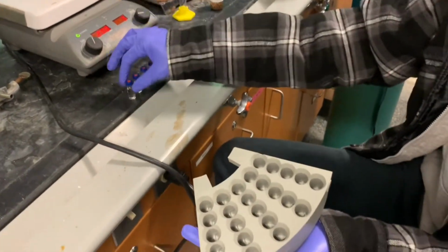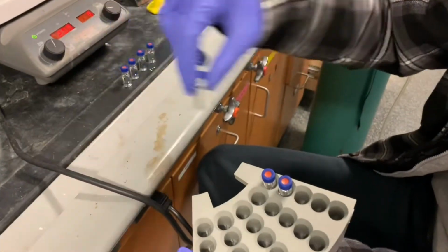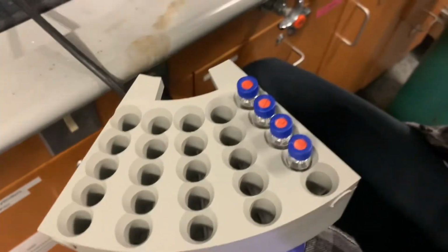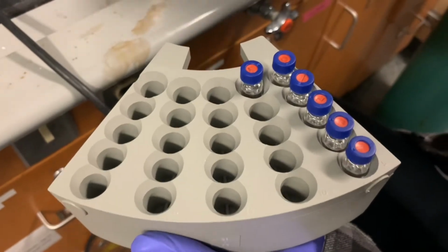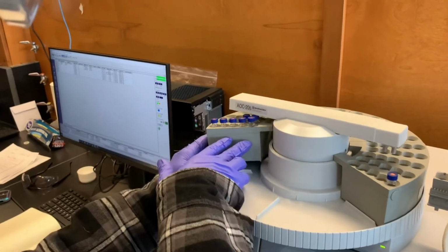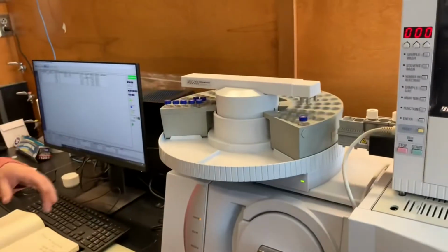Once you have taken all of your samples and you are ready to insert your vials into the GCMS machine for analysis, it is very important that you rack them as I demonstrate. You start in the top right of the rack, and then you work down the row, and then continue at the top of the next row. Once your vials have been correctly put into the rack, they are ready to be inserted into the instrument. On your rack, there is a number corresponding to its position in the instrument. Place accordingly.